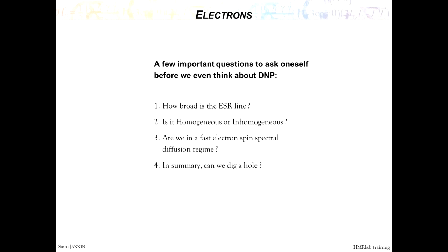Yes. So, with saturating the microwave, this also induces some heating of the system, right? The temperature is increasing and maybe there is a compromise with the DNP polarization. The point is, in my case, I have worked with glasses, and sometimes the effect of temperature increase is really leveling out the polarization. I don't think that in liquid DNP it is like this. So we see that if we increase the microwave too much, there can be a decrease in polarization because of the heating.